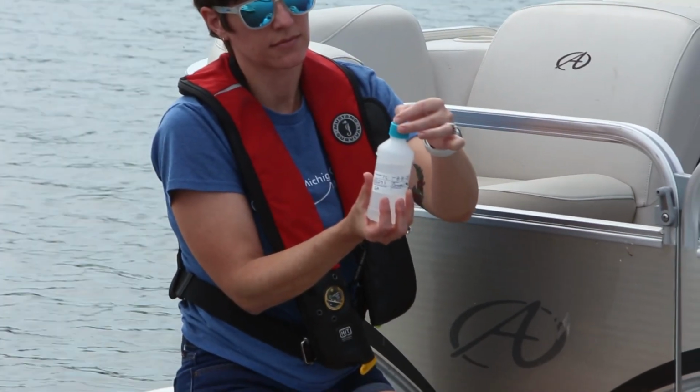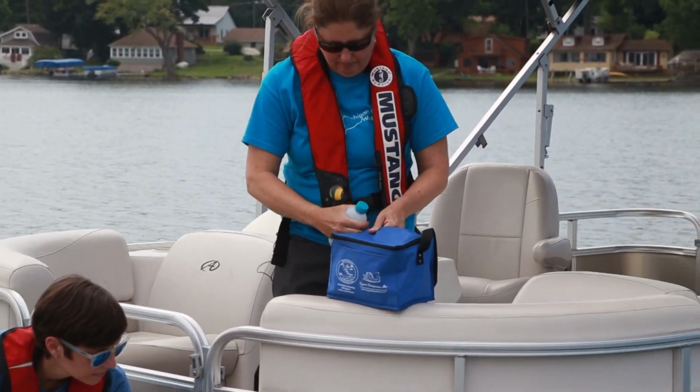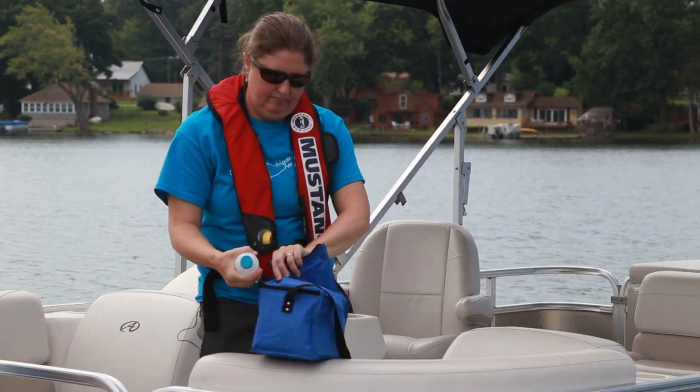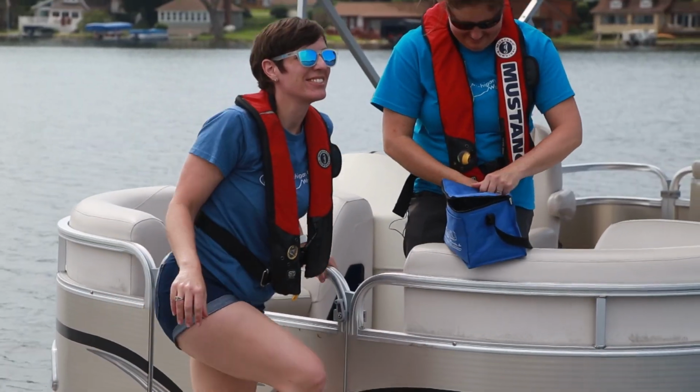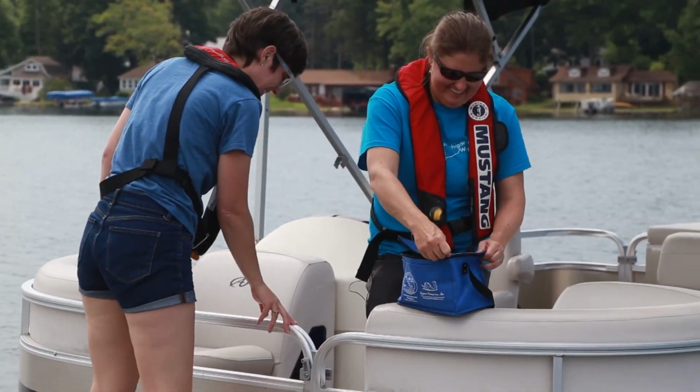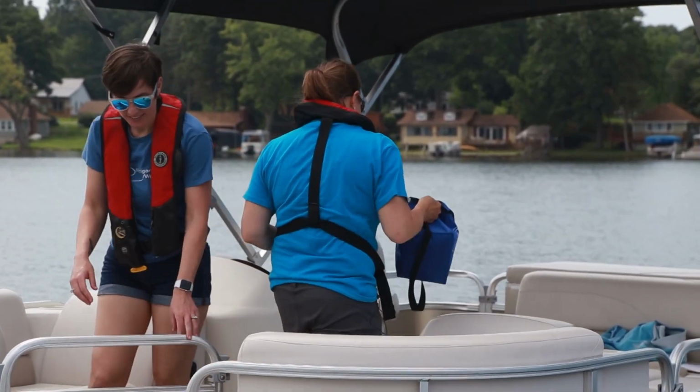Store the bottle in your cooler with an ice pack, and then collect your replicate sample the same way you collected your first. Once you're done with the replicate sample, store the bottles in the dark cooler with frozen ice pack and return to shore.